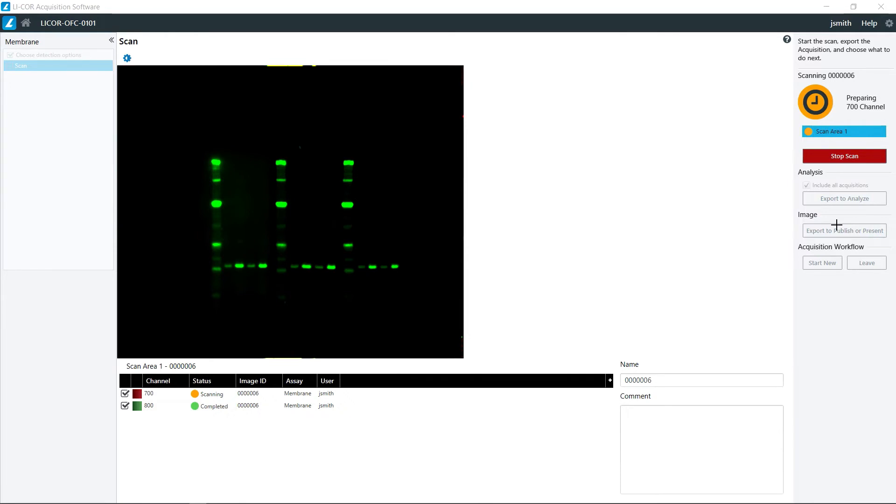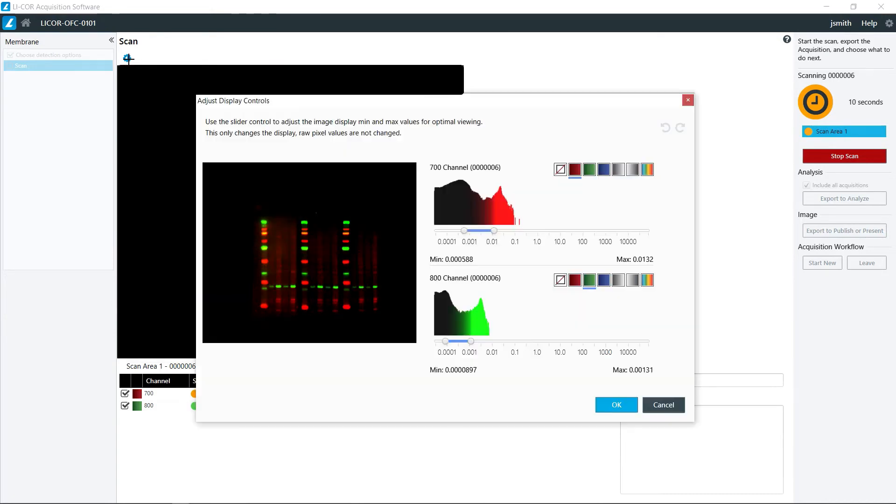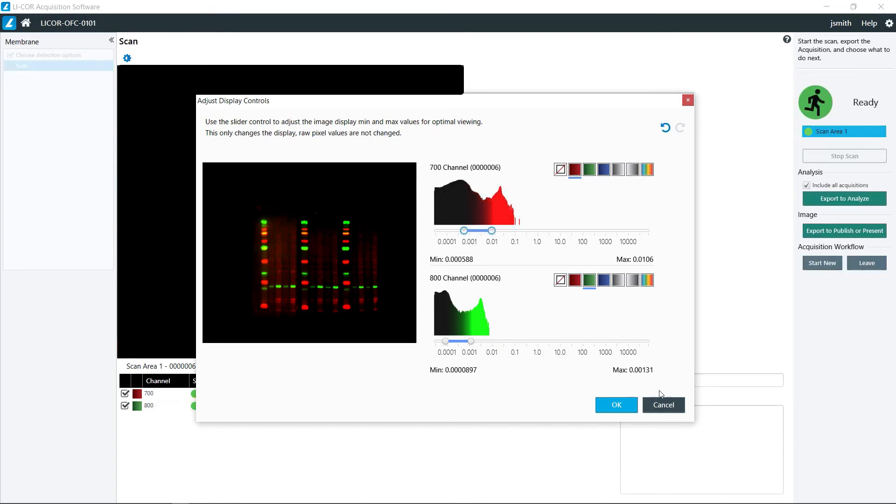While this is going on, if you need to make adjustments to the image display as it's being collected, you can click on this little gear icon right up here and make adjustments to that.